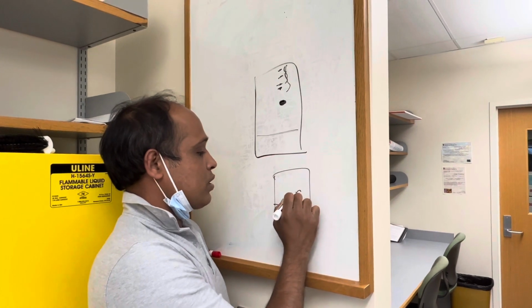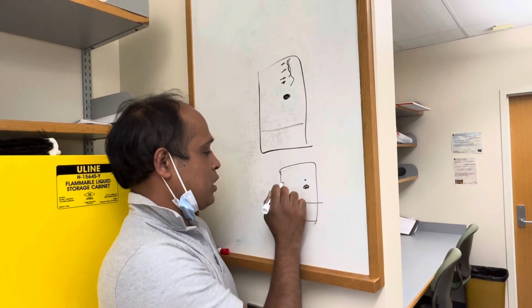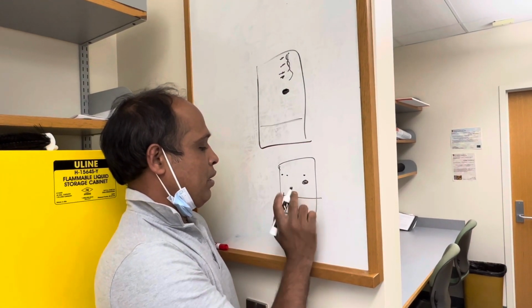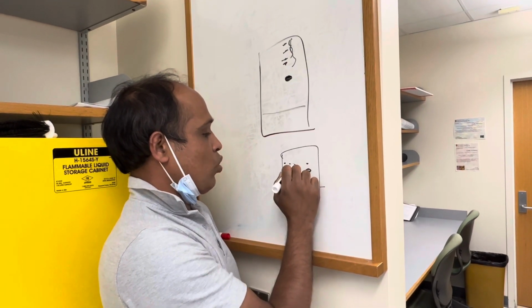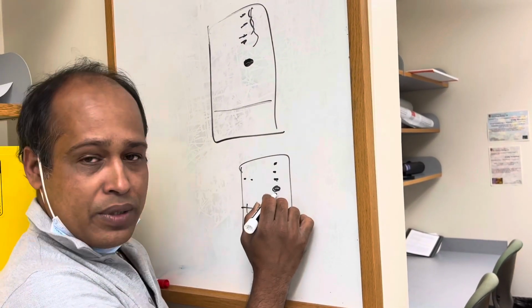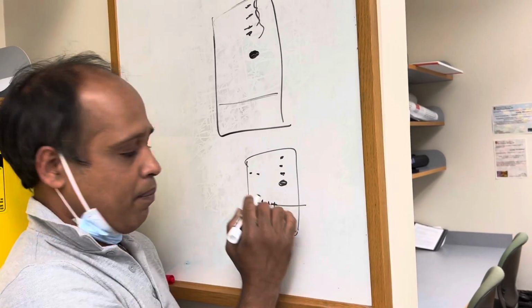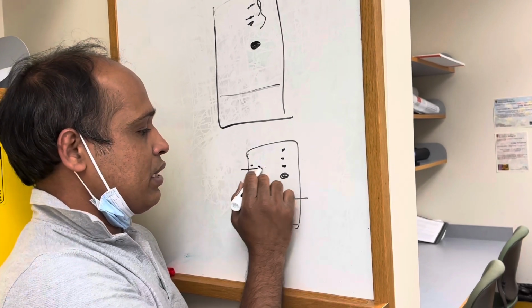And when you see your crude material is here and you do a couple of spots here, maybe make more spots, okay? These two spots are not showing up here. That means it was your last spot, suppose it was your last spot just before your compound. So these two spots you are getting, but the next two spots are nothing. So it's out. That means this part is out.